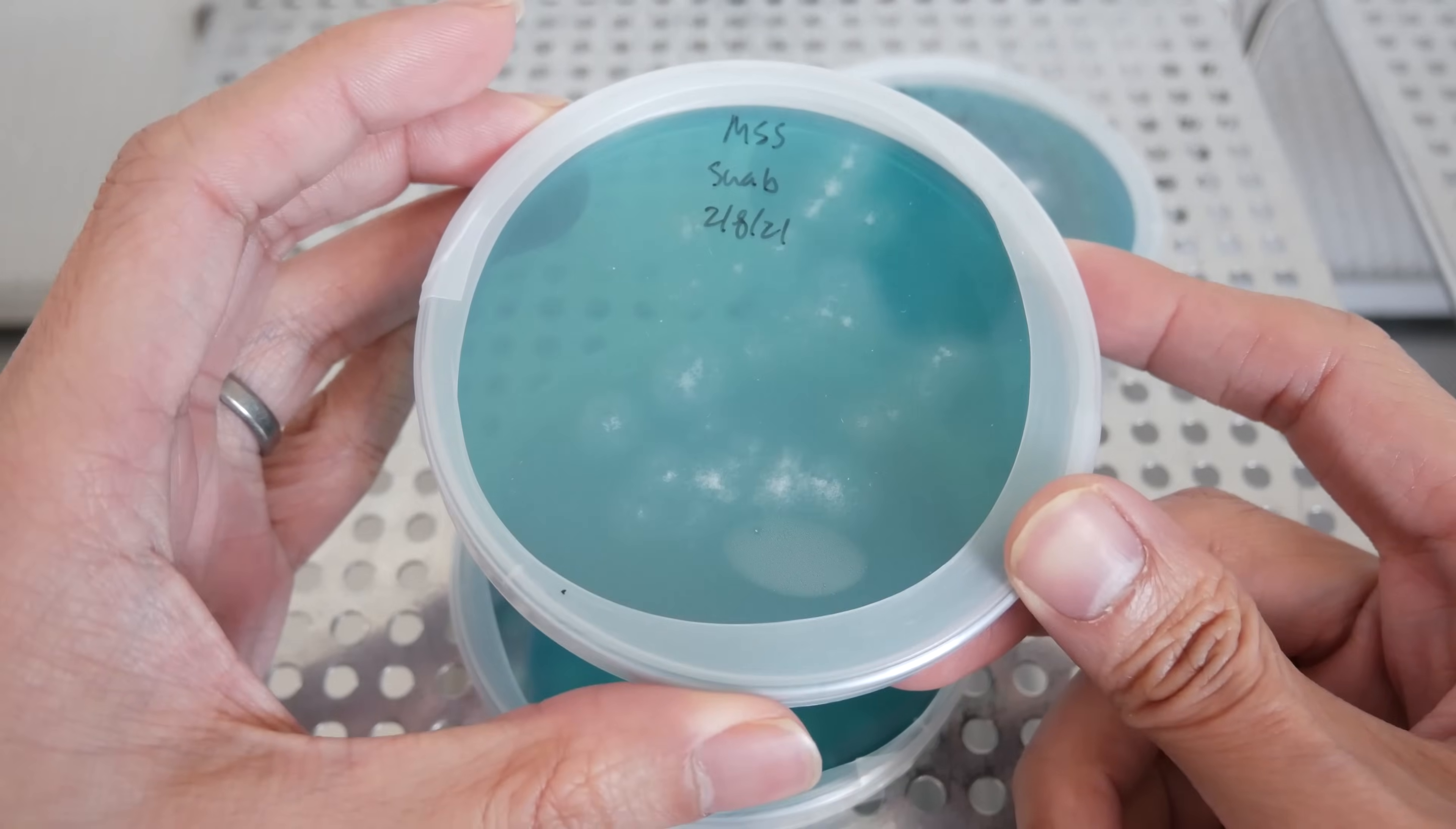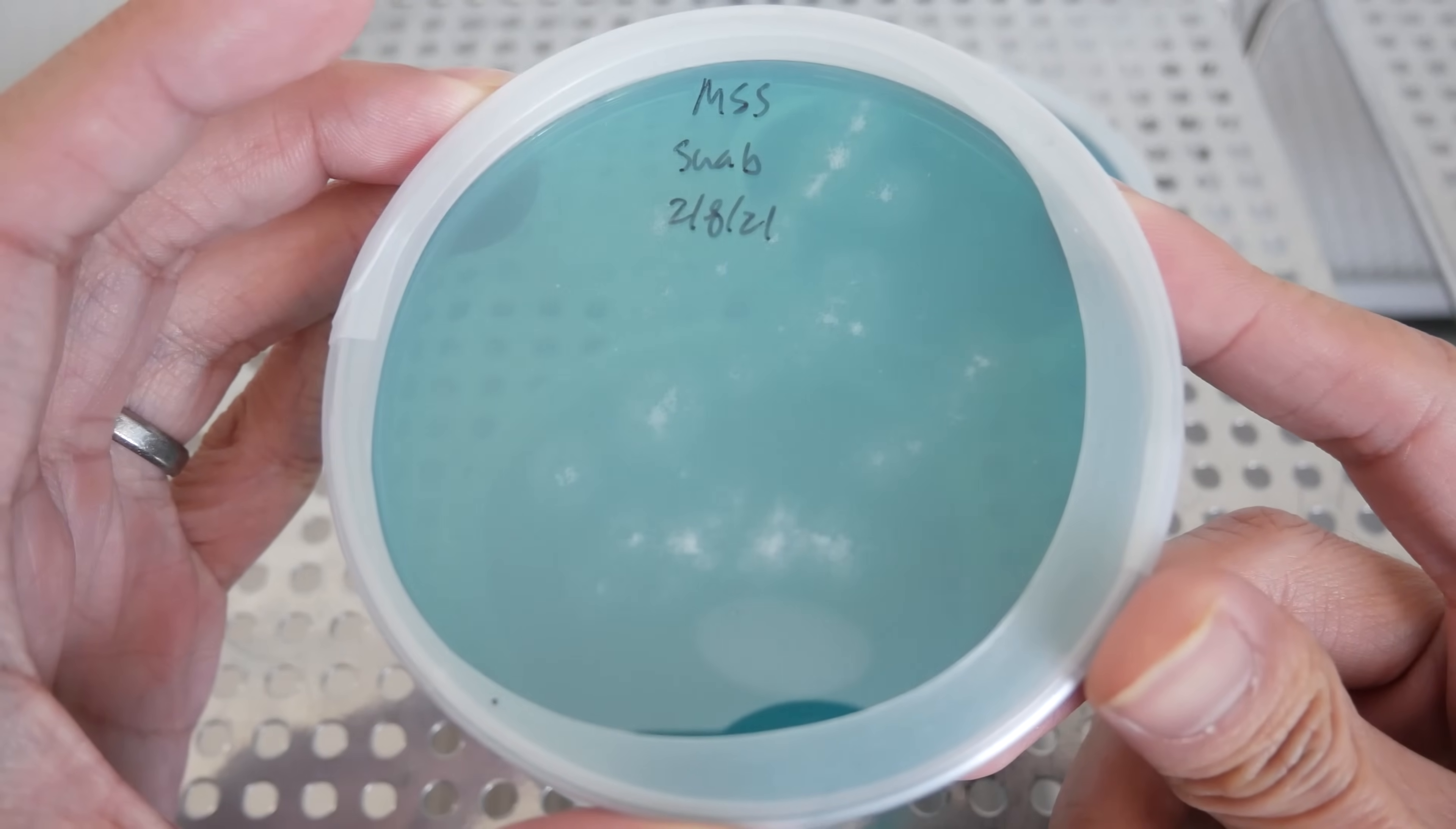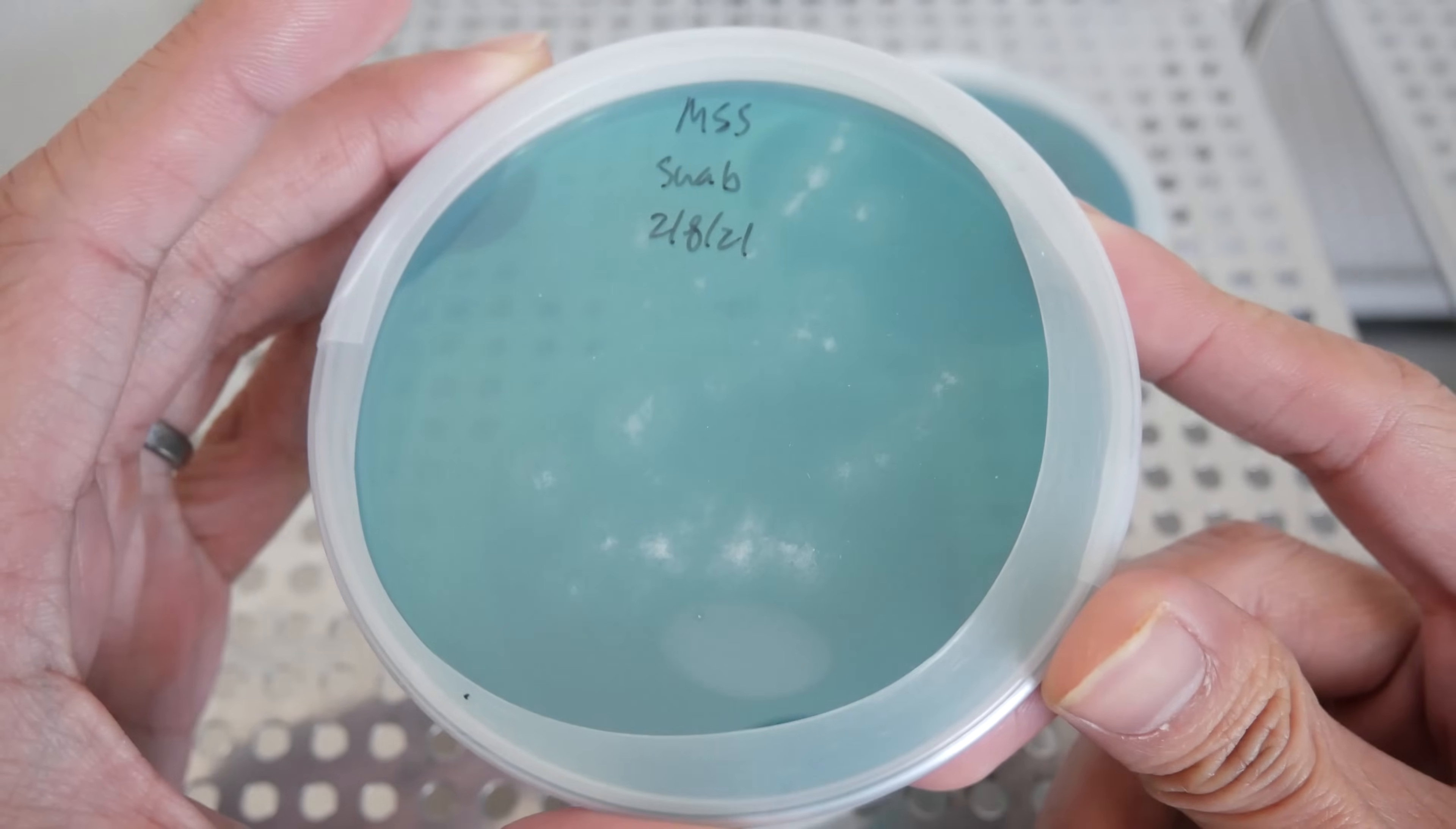Here's the swab plate. Since we streaked swab across the plate, there's going to be multiple inoculation points for the spores, so you end up with multiple germination points. I find the success rate of germinating spore solutions a lot higher with the swab and the inoculation loop.